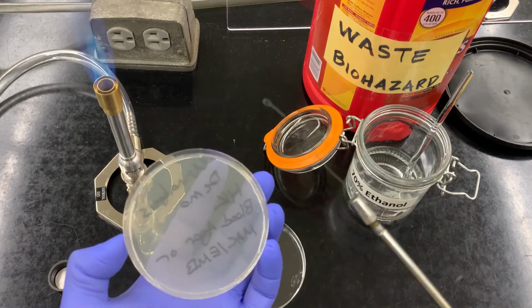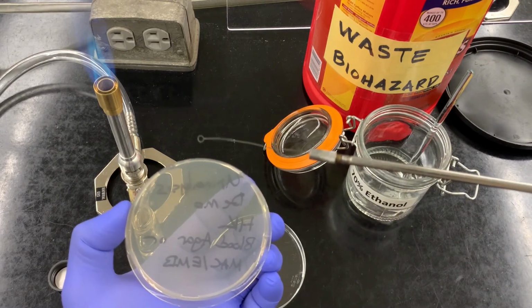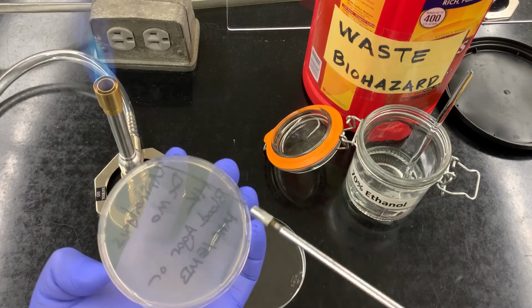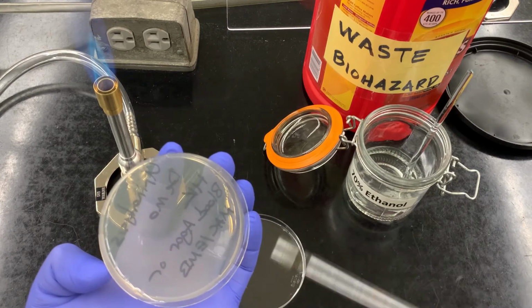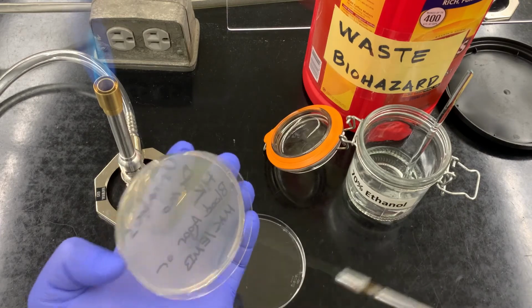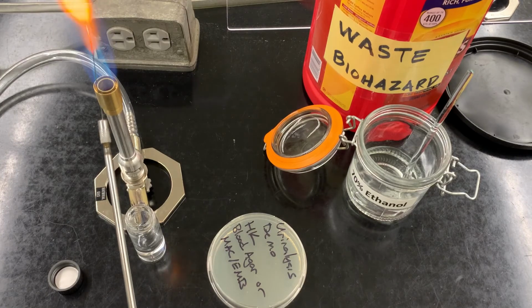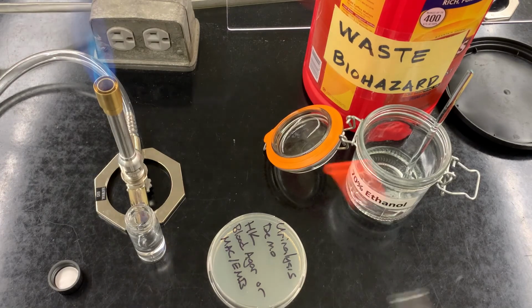Let that loop cool. And then now I'm going to use my loop to spread the urine sample, very much like I would with a swab, right? So this was where my line was, up and down. So I'm going to go like this, turn it on its side, and then just back and forth one time, top to bottom. And then hopefully that'll have it nicely spread out. Hopefully we don't have too much bacteria. Hopefully we can quantify the amount of microbes in that sample.